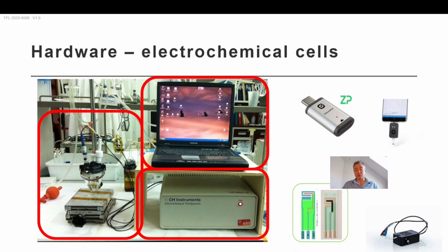And also something that's modernizing, let's say, at least electroanalytical chemistry, is the availability of screen-printed electrodes. Now, I have to make a disclaimer here that at Zimmer & Peacock, we do manufacture screen-printed electrodes, and they are extremely high quality. I think there's a lot of screen-printed electrode manufacturers out there. You have to be a little bit careful because the variability from electrode to electrode can leave people with a bad impression on screen-printed electrodes. But when they're made well at high quality, then they really are excellent and repeatable and as good as, and I'll touch upon this, things like glassy carbon electrodes.